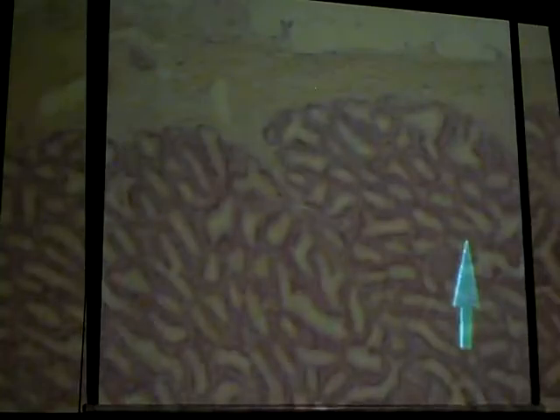And it's just going to be identify the organ. All right, the epithelium varies from pseudostratified to simple columnar, I think. So we're not going to focus too much on the epithelium. We're just looking at low power. You're just looking for that characteristic appearance of the gland. All right, so this is your seminal vesicle. This is going to be adding most of the semen to the sperm that's passing through.